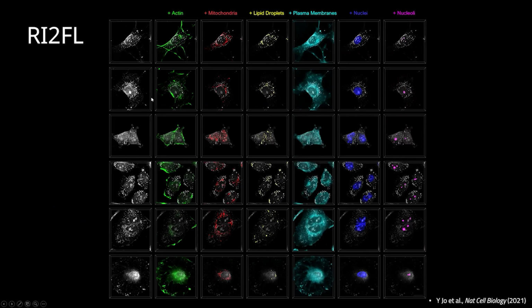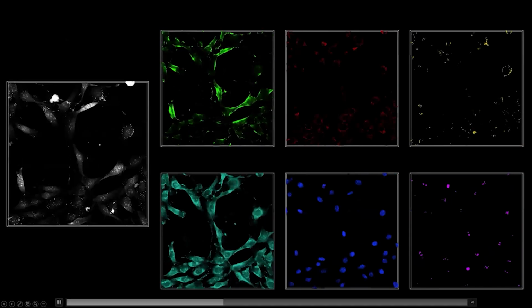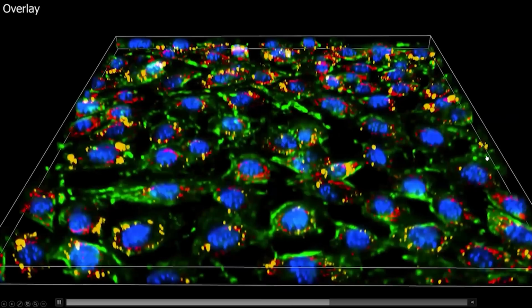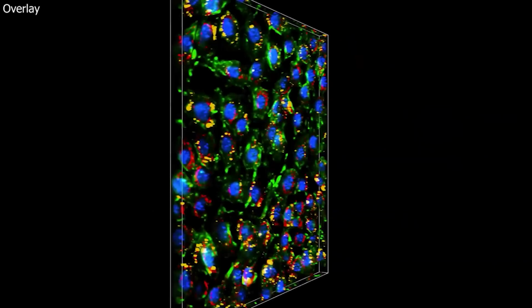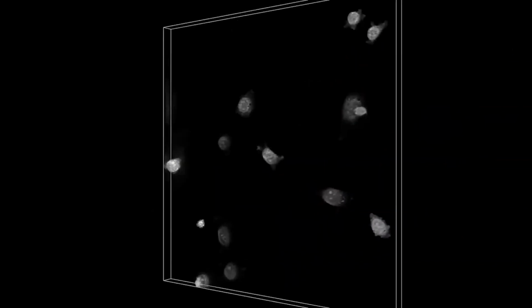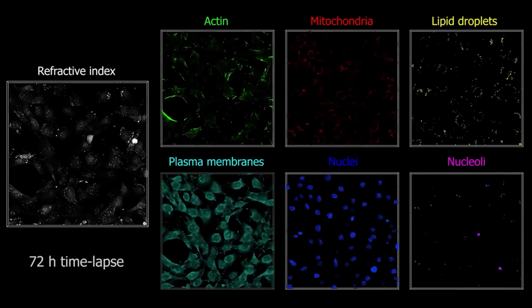On the left-hand side, you can see the label-free HT data. On the right-hand side, this is all virtual 3D fluorescence in 3D. And you can do 3D biology analysis, spatial biology analysis. So this is the input data set, and those are all generated by AI. As of now, we are working on the development of a phenotypic drug screening method based on the use of the label-free holotomography system and AI approaches.